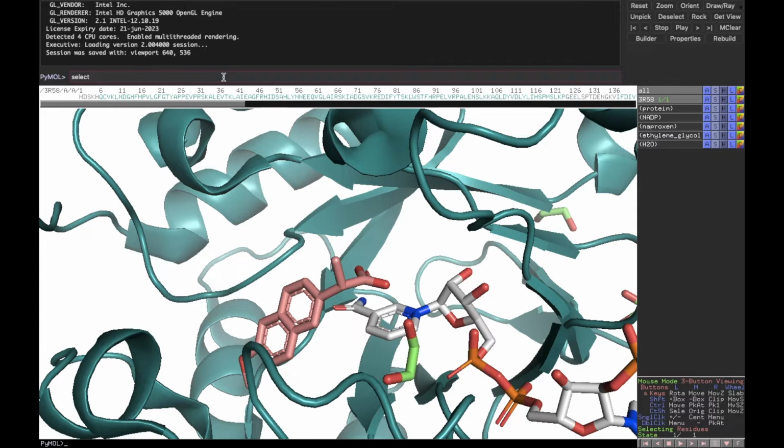And once we get here, we have a couple different options. So we're looking to select histidine 117 and tyrosine 55. We can use either RESN, which means residue name, in which case we will follow this with something like HIS for histidine. But this command here will select every histidine in our molecule, which is sometimes helpful, but in this case we don't want every histidine in our protein, we just want one of them, 117.